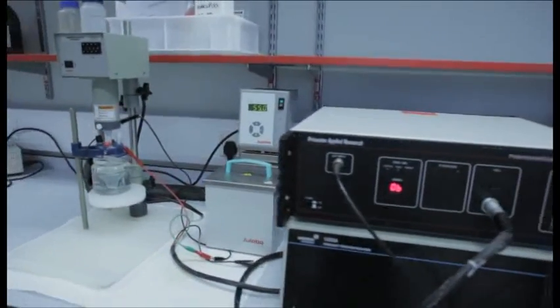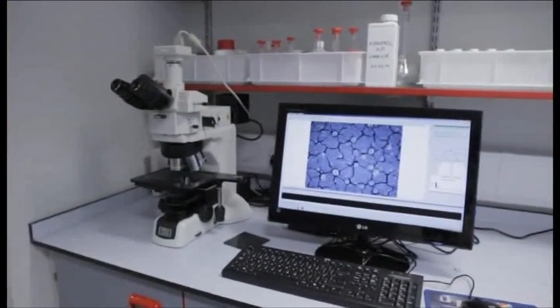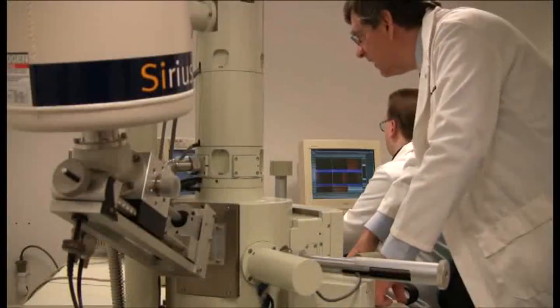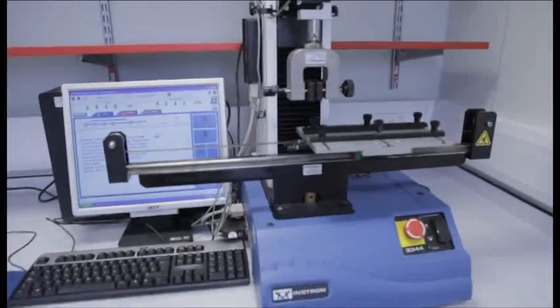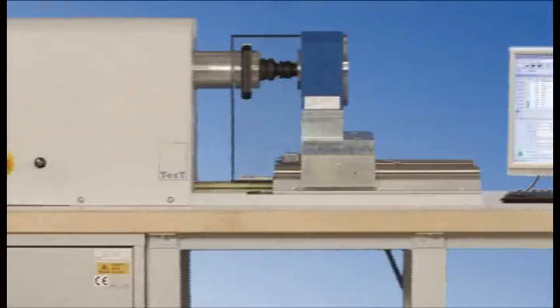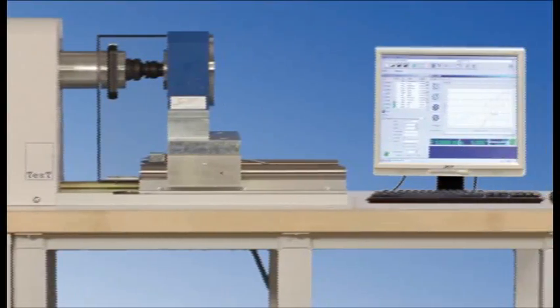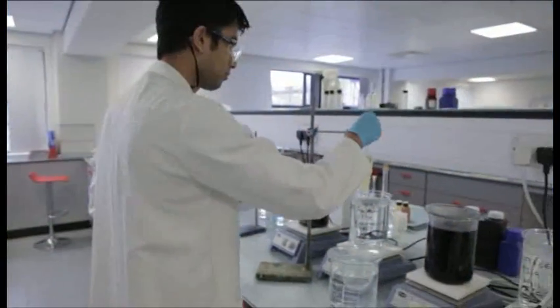We assess coatings using optical microscopy, scanning electron microscopy, XRF, and color and gloss measurements. Tensile testing assesses mechanical performance, and frictional performance is measured using torque and tension equipment. The next stage in the product development process is bench testing.